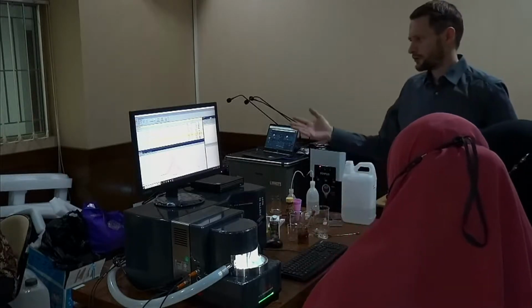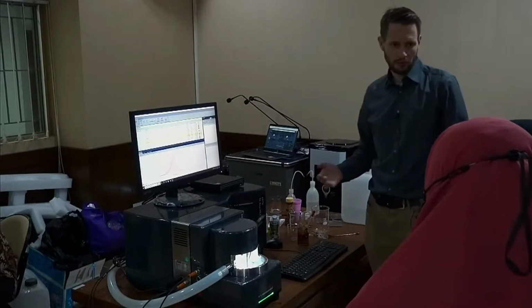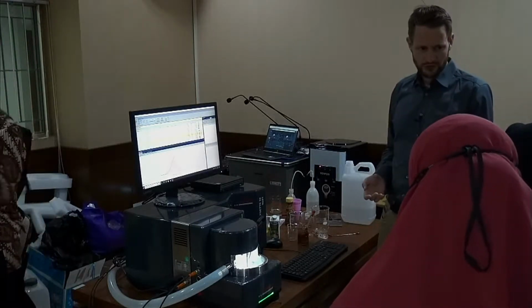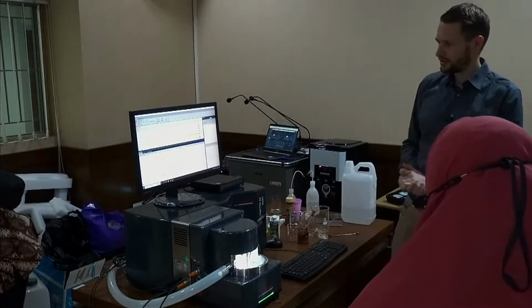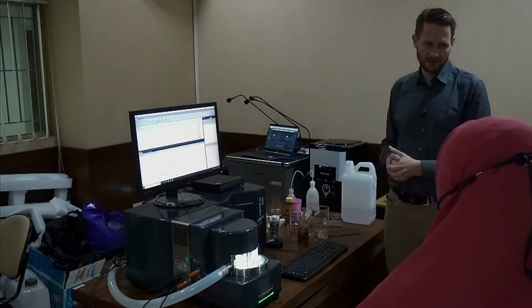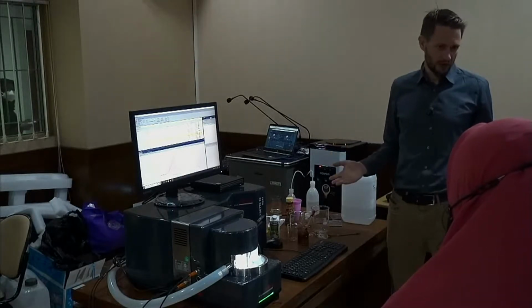Of course, now we just use the parameters from the database, which probably our old laboratory boss put in there some time ago. I would definitely do some research on Google or on any research platform to find what the results in science are for the refractive index for this material, for magnetite. And then pick a parameter, go with it.